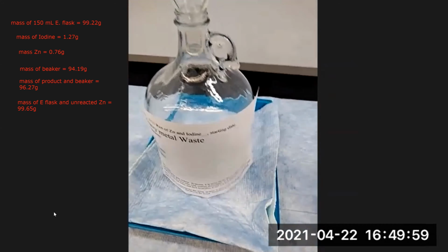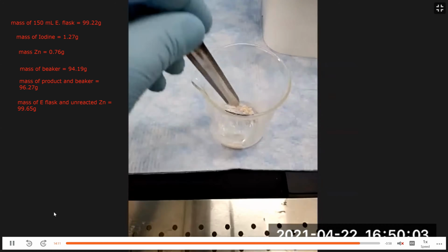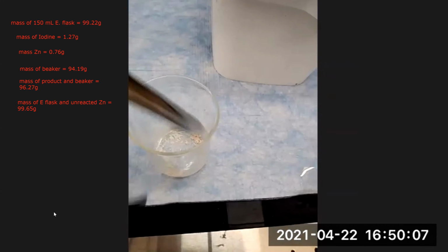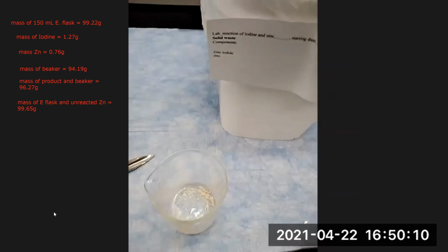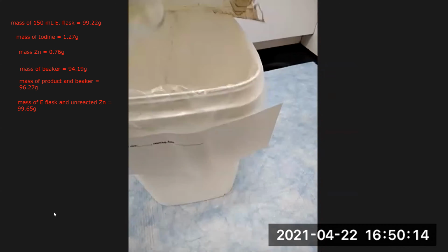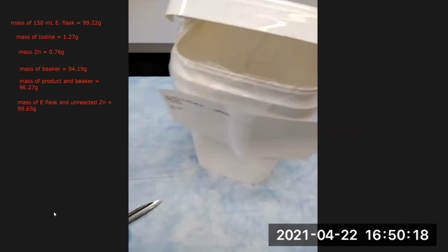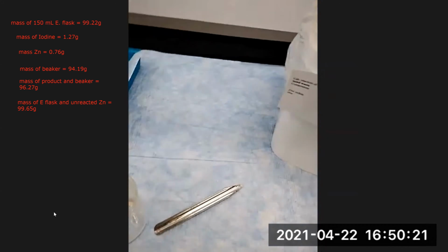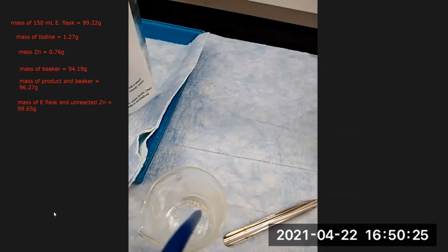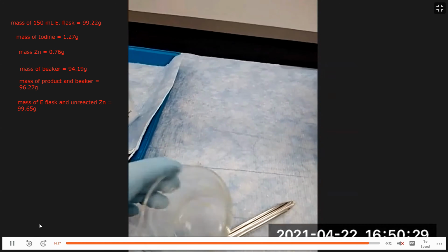We scrape off the zinc iodide product and put it into the plastic solid waste container. When we're rinsing, we put the rinsings into the glass bottle. And that's how we dispose of the waste for this experiment.